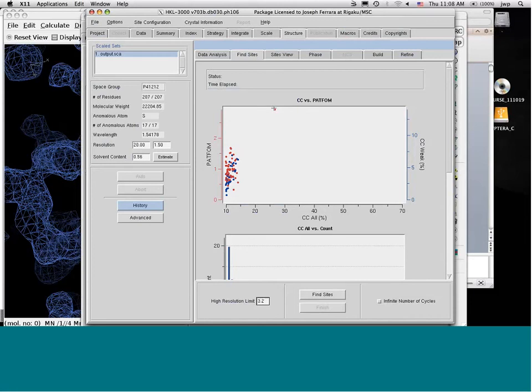So we have another question from Dilip, and he's collected at BM14. Maybe that's APS. ESRF maybe. Okay. Yeah, a 2.9 angstrom data set. And he tried to solve the structure with AutoSolve, but he's saying he had a problem with data quality. So then he started shooting for redundancy, and he collected 360 frames of peak and remote data. So I think what he's basically asking is, if you have a problem with data quality, will redundancy help you if initial methods fail? What do you recommend?